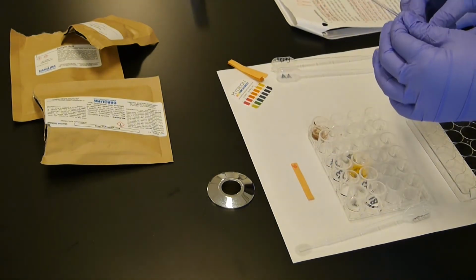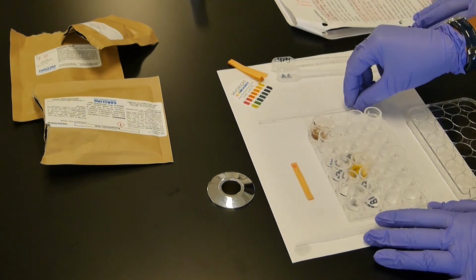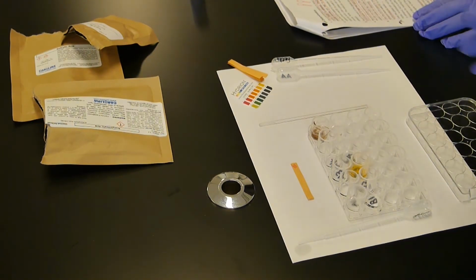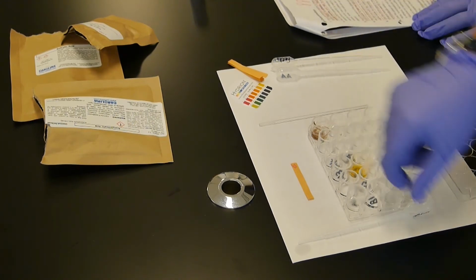So that's how you continue to do the experiment. Next, collect all the data and put it in the data table. The next part essentially has us transferring 10 drops of the ethanol from well B2 to A2. So we have shown you how to do the lab, how to test the pH, and how to mix the solutions. Follow the rest of the procedure in the lab, and then make sure that you write your observations in the data table that's provided for you in the lab. Thank you.